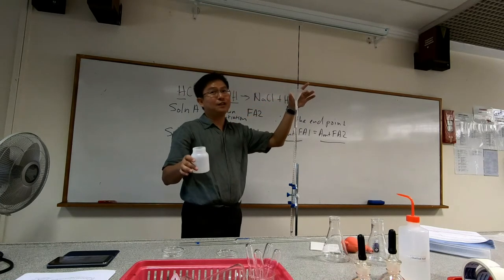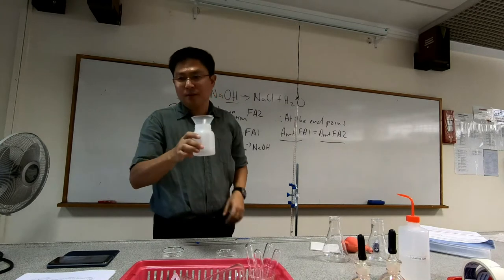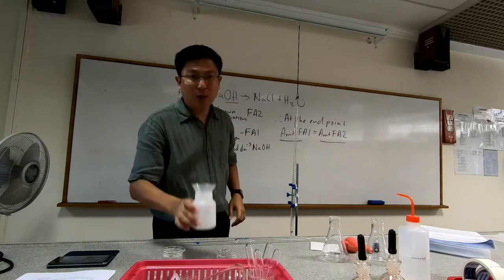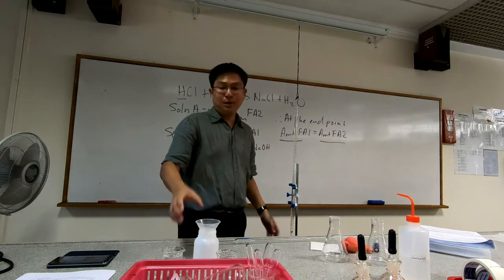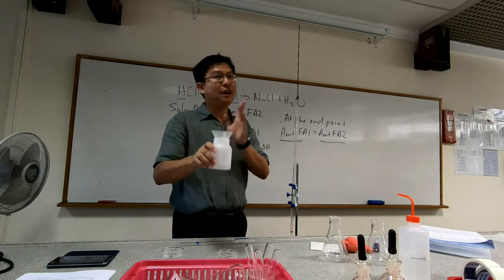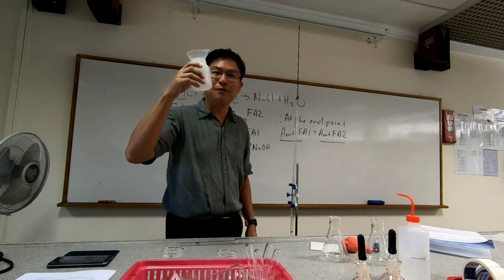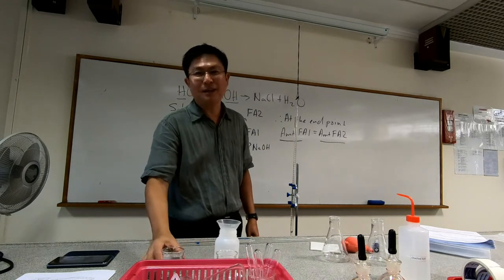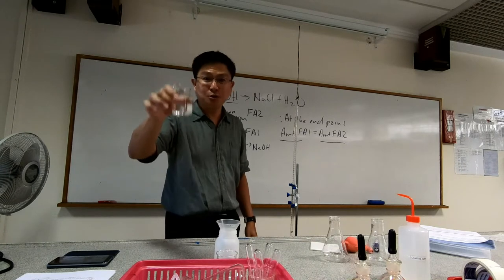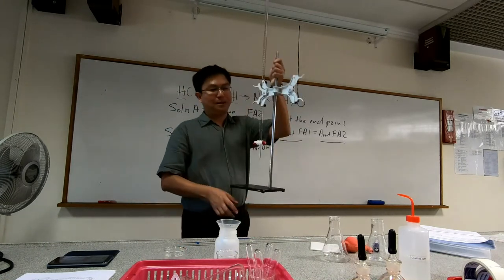After I finish filling, it is a good practice to put the filter funnel back into FA1. Why do we do this? Because number one, when I put it back here, if I ever need to fill it again, I will be holding the correct bottle of FA1 and I will not mistake it by filling up with FA2. After it's filled, I put it up here.